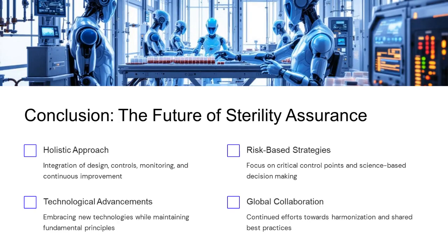The future of sterility assurance involves a holistic approach, integrating design, controls, monitoring, and continuous improvement. Technological advancements are embraced while maintaining fundamental principles. Risk-based strategies focus on critical control points and science-based decision-making. Global collaboration continues to drive harmonization and shared best practices.